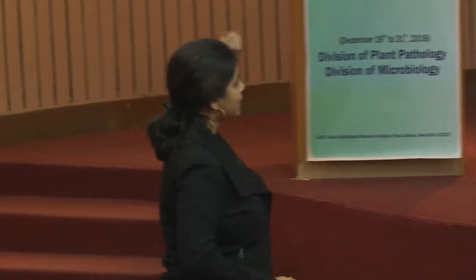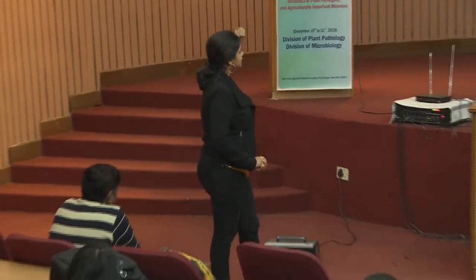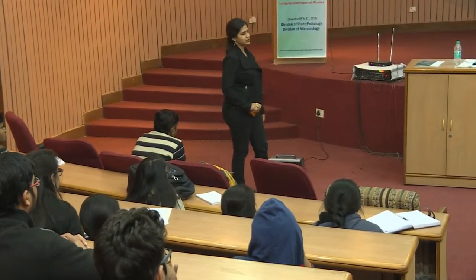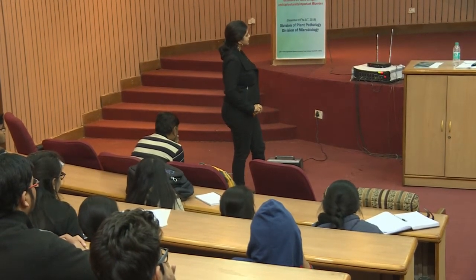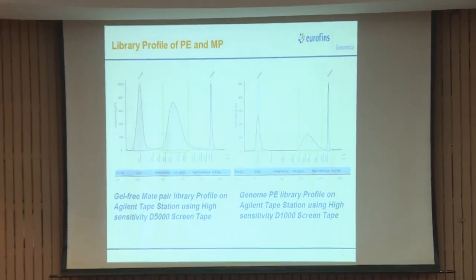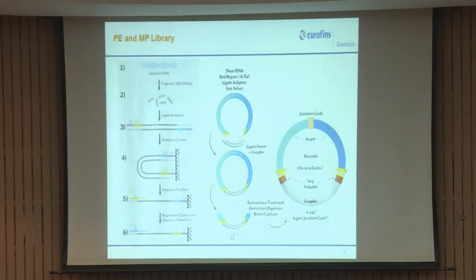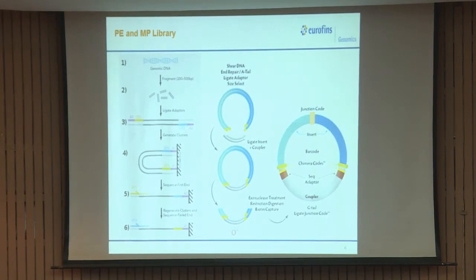And now, in paired end, because it has a smaller distance between two reads, somewhere around 495 minus 120, that is what my library is. So, you can see the library size is small. So, this is how we check the library QC on a tape station or on an Agilent bioanalyzer. This is the library which I was talking about.